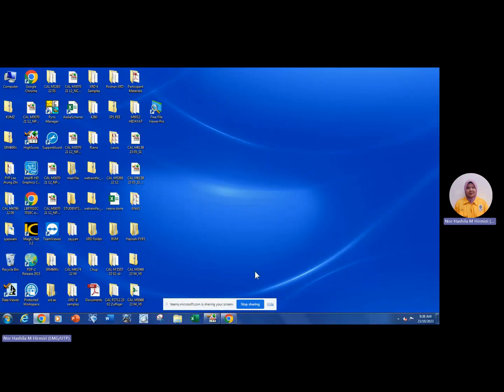Hi, Assalamu'alaikum. In this video we show you how to analyze XRD results using HighScore software for phase identification.